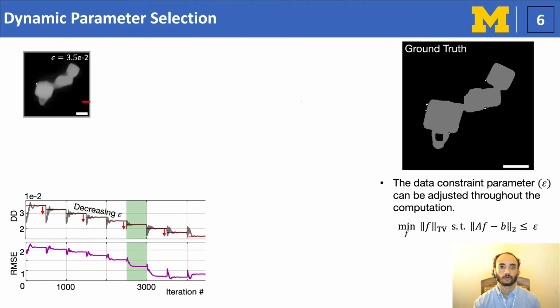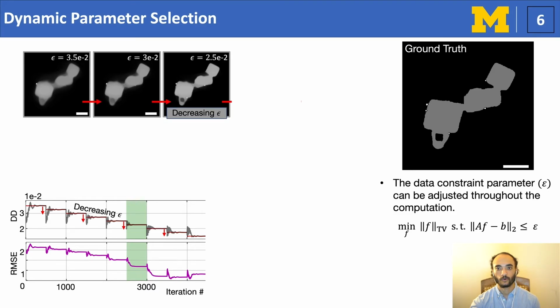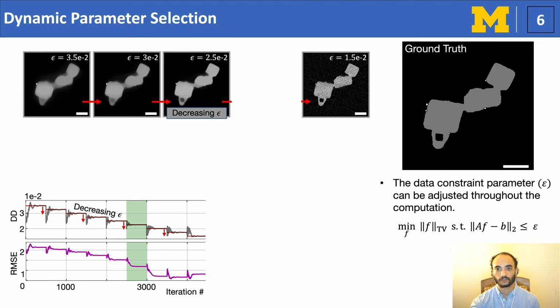To alleviate the arduous process of determining the best epsilon, we have developed the ability to visualize intermediate results as users manipulate this tunable parameter. This means there is no need to reset the computation, and now the algorithm will use previous estimates to quickly explore new tolerances. The user can change epsilon as the reconstruction is running to make on-the-fly adjustments instead of waiting for the computation to complete. Tightening the tolerance produces a sharper tomogram, and we see internal voids within the STO volume become visible. However, over-tightening this parameter will retain noise structure from the previous projections, and the best value is highlighted in green.